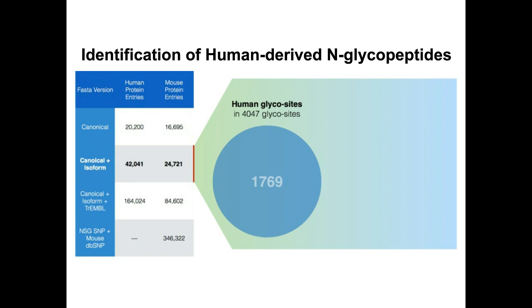Now, if we take our peptides and compare them against different protein sequence databases of increasing complexity, they're most definitely not perfect, and assigning species, of course, is associated with a caveat based on the quality of these protein sequence databases. So we compare, for example, to a slightly smaller protein sequence database containing only canonical sequences. 5 of our human peptide sequences could also be identified in the mouse database. If we compare it to a slightly larger, less stringent database that also contains predicted proteins, another 36 disappear.